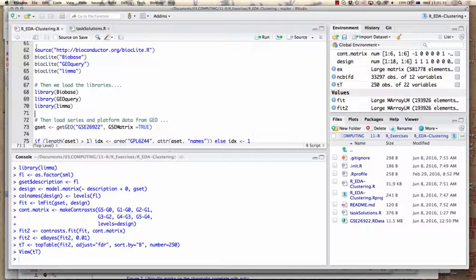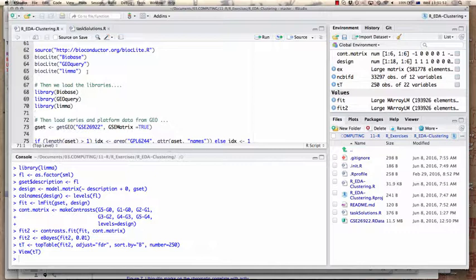The point where we left off was that we installed libraries from Bioconductor — basic libraries for dealing with Bioconductor objects, a tool that queries and downloads GEO datasets from the NCBI repository, and a tool for statistical analysis. The dataset we're working with is a time series analysis of HeLa cells, GSE 26922, which is somewhat similar to the yeast dataset we worked with before, but done with a different and later technology.